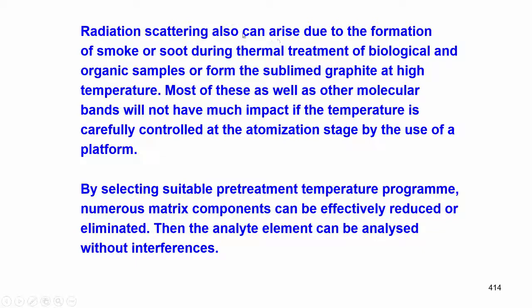So, radiation scattering can also arise due to the formation of smoke or soot during thermal pretreatment of biological and organic samples, or from graphite sublimed at high temperature.